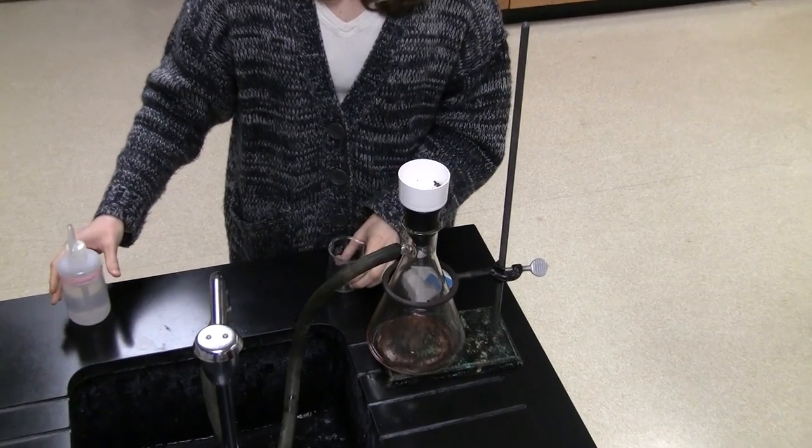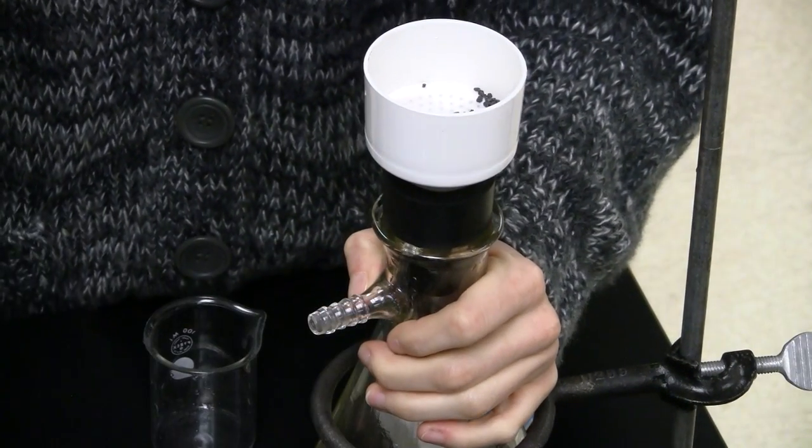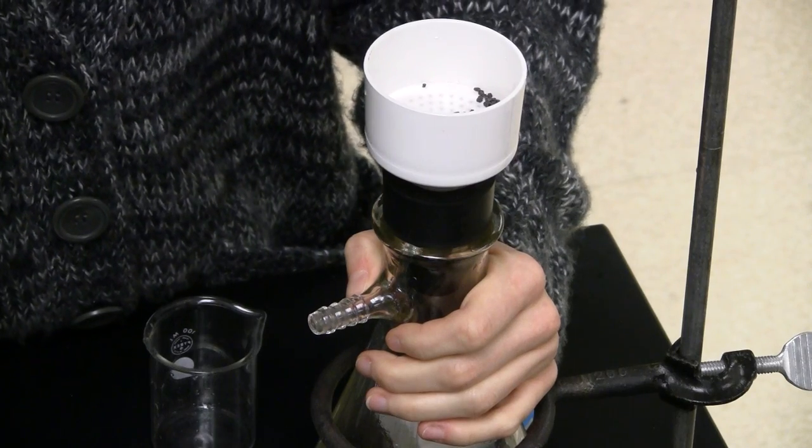remove the tubing from the side arm before turning off the water. Otherwise, water can back up through the tubing into the flask, contaminating your filtrate.